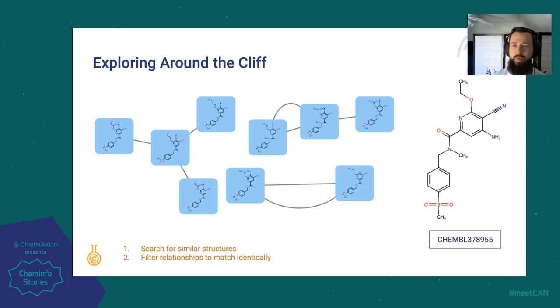Now, once we've identified an MMP that leads to activity cliff-like behavior, it's time to explore a little bit around the cliff. One way to achieve this could be as follows: Let's say we've identified a transformation that leads to the formation of a cliff. We've done a little similarity searching, or perhaps expanded on the nodes, and we noticed that the other compounds affected the most by the transformation are all structurally similar. How can we generalize this to interrogate all the similar structures? The answer is a simple combination of similarity searching the nodes and then filtering on the relationships. So by first returning all the structures in the database that are similar to our principal structure of interest, and then filtering out on the relationships to only match those identical to that matching MMP, we're able to easily view this data across the entire database.